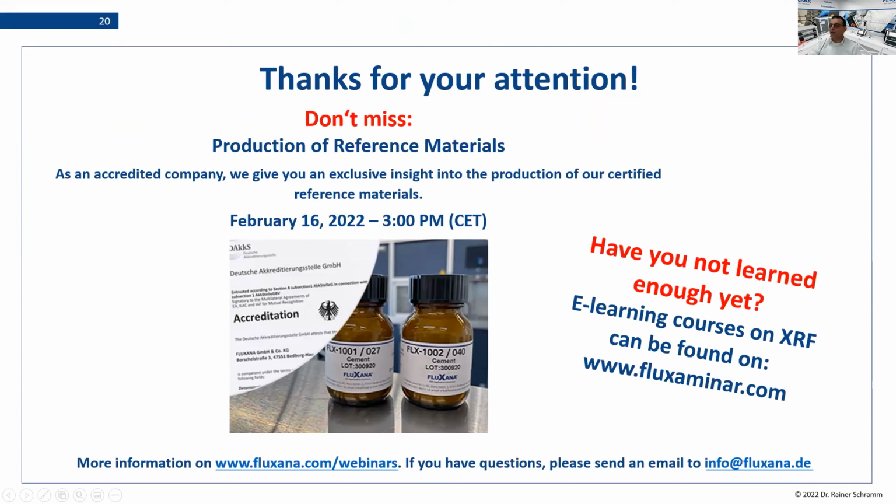There is one question: how do I know the detection limit of each element? You could use here the classical approach. That means you measure a sample 10 times. And then you calculate the standard deviation for every element, and the standard deviation multiplied by 3 would be your detection limit. This is a first approach. Of course, the closer this result is to the real detection limit, the more precise it is, but this is a good starting point.